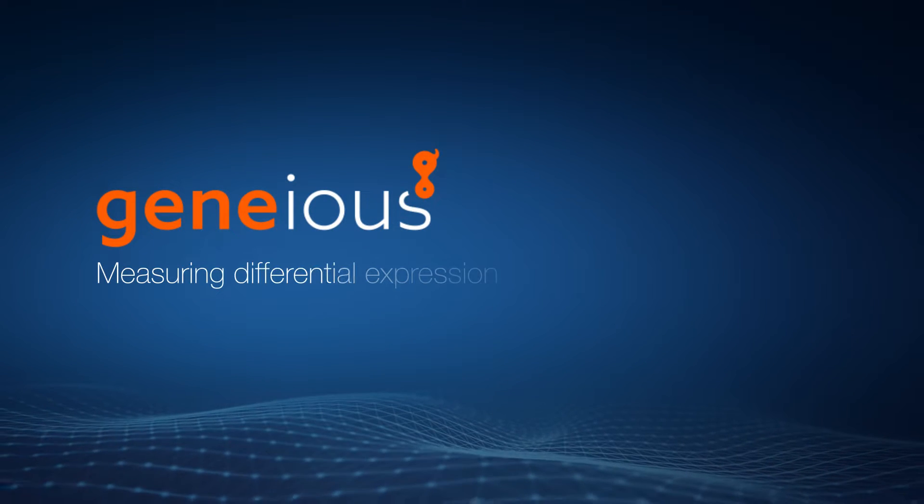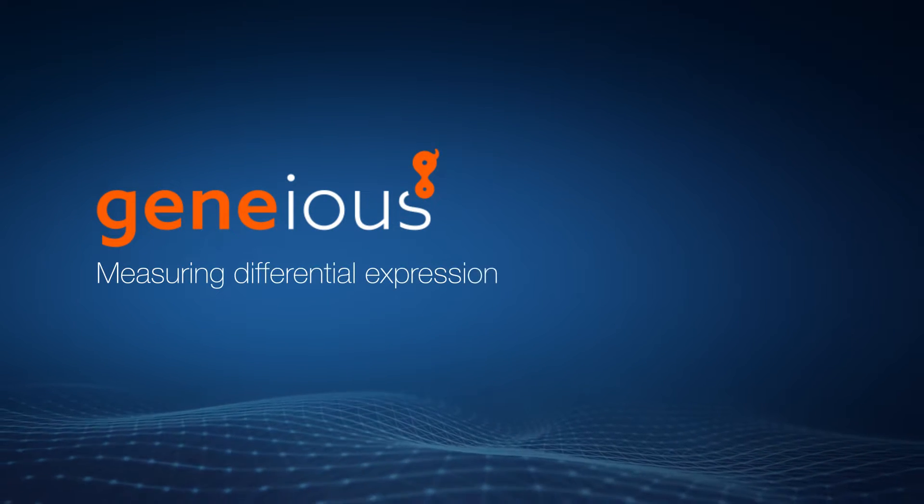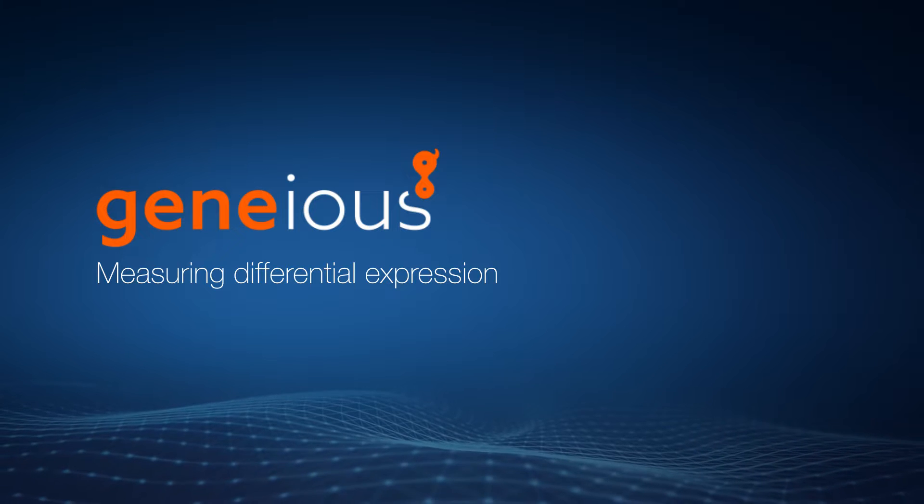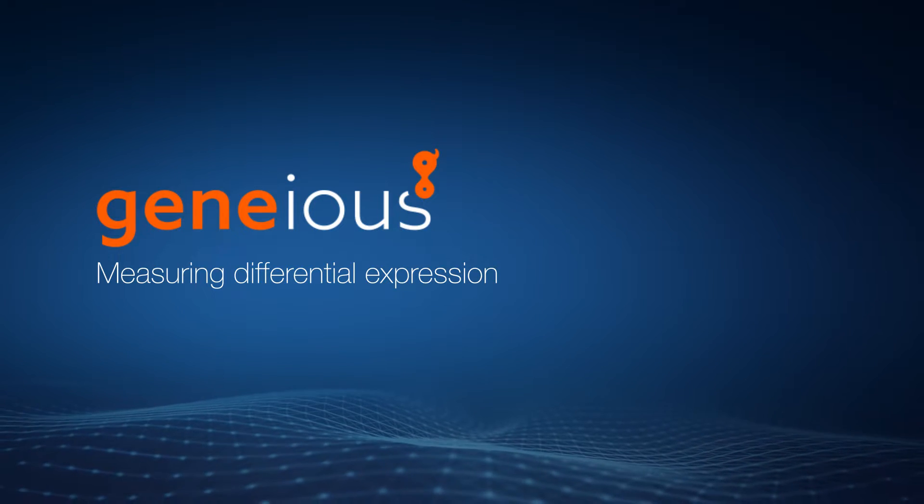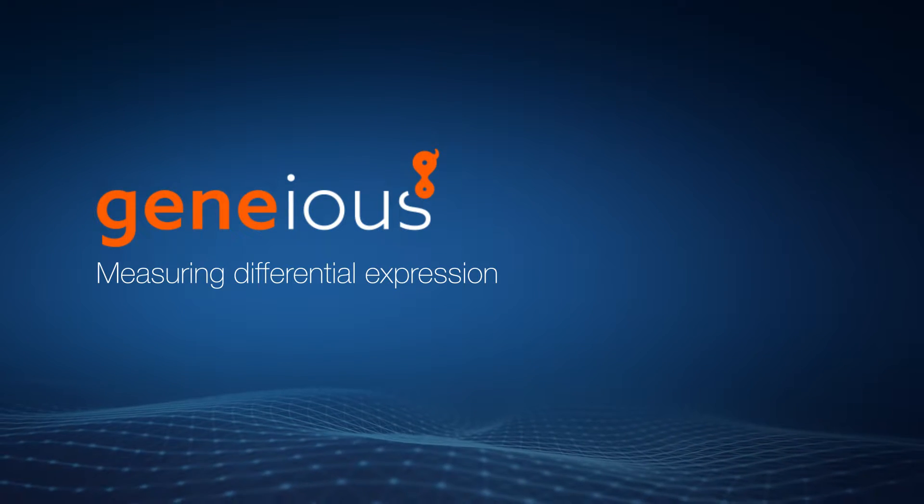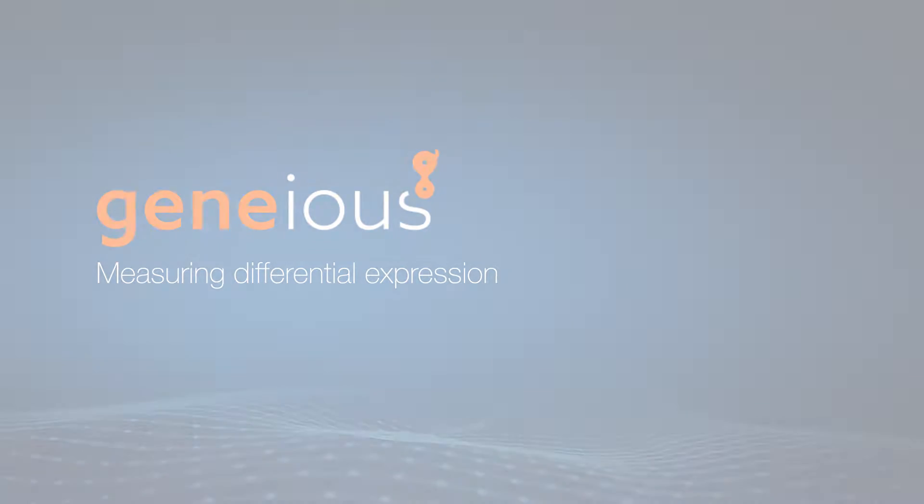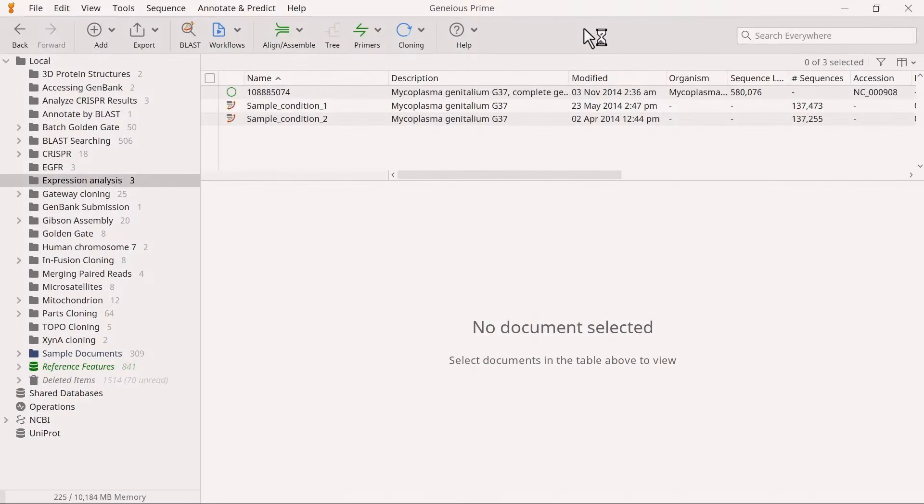Welcome to this video on measuring differential expression using RNA-seq data with Genius Prime. To begin, you must map the different sets of reads to a reference sequence.